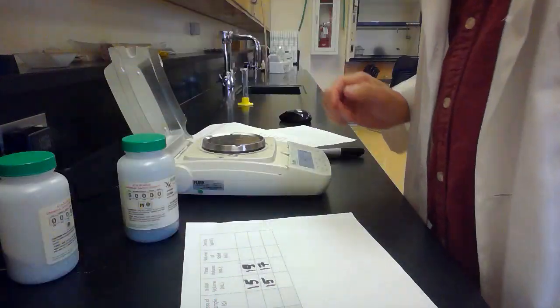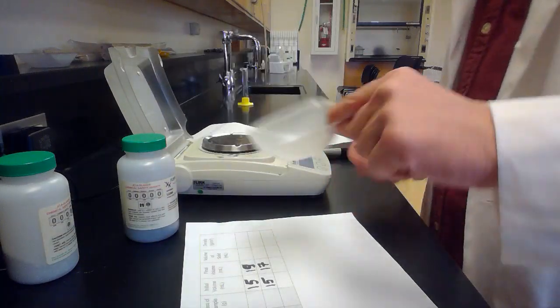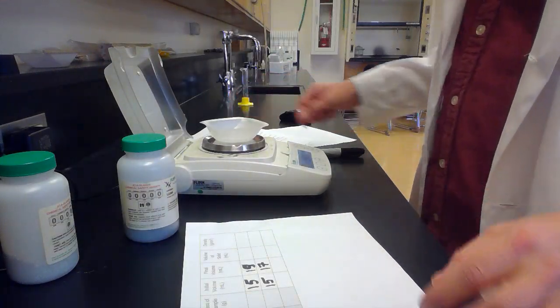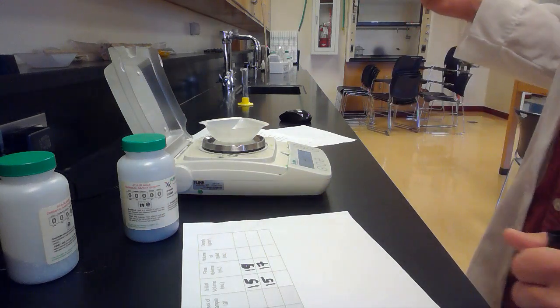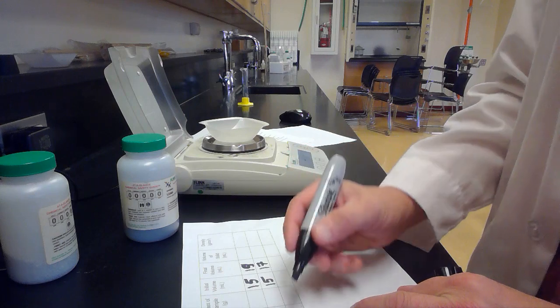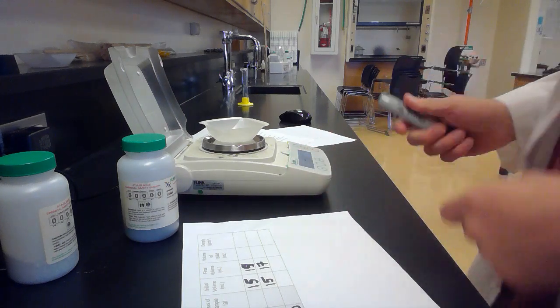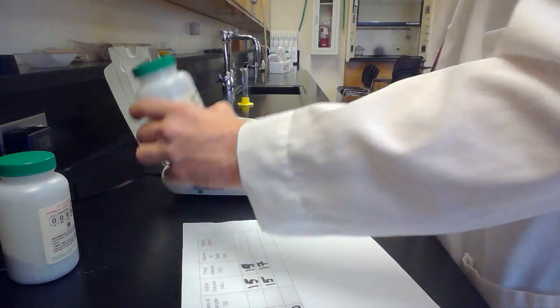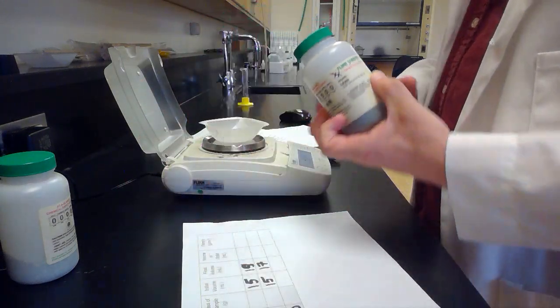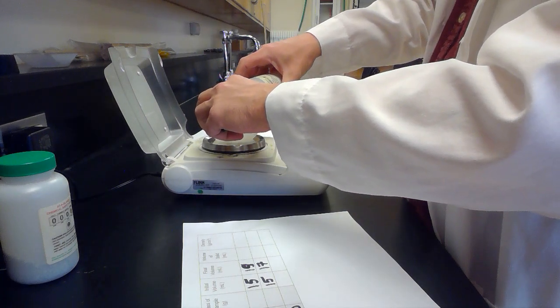Okay. And then the last one here, it says Pb on the data sheet. Pb is lead. So I'm going to take another weighing dish, put it on my scale. It's 2.40 grams. So I'll put that for the mass of the beaker, 2.40. Now we want to get some lead in there, so I'm going to take my lead. This is about 8 grams, but you know, it really doesn't matter exactly how much.